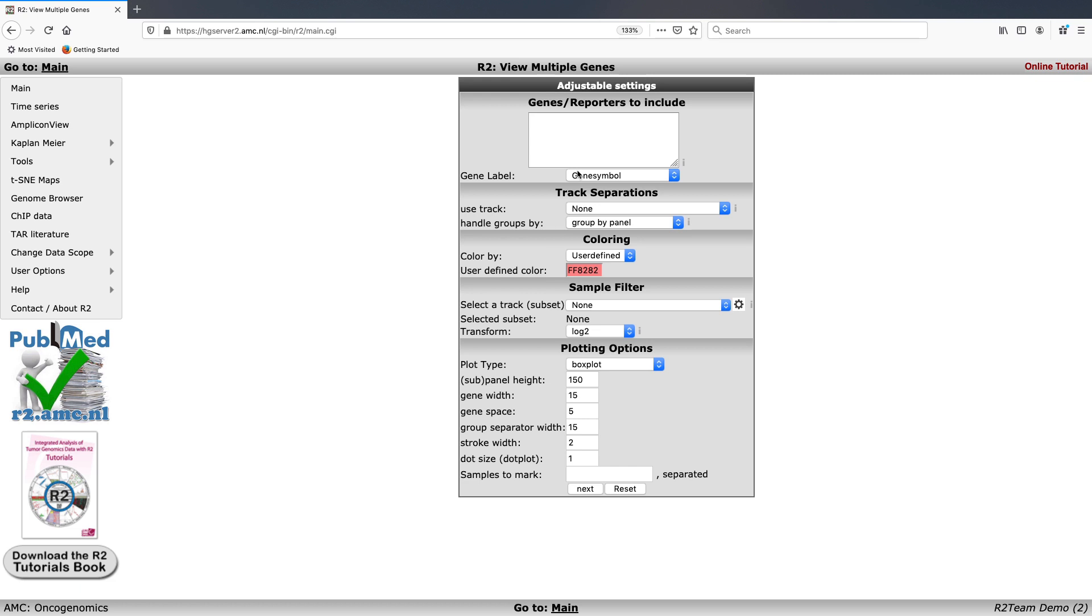Here you can see that you can enter in a list of genes using either the gene symbols or reporters, in this case Affymetrix platform reporters.